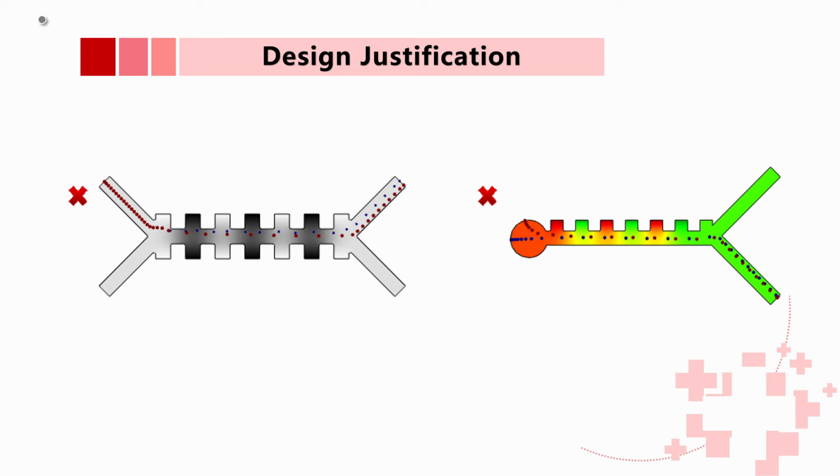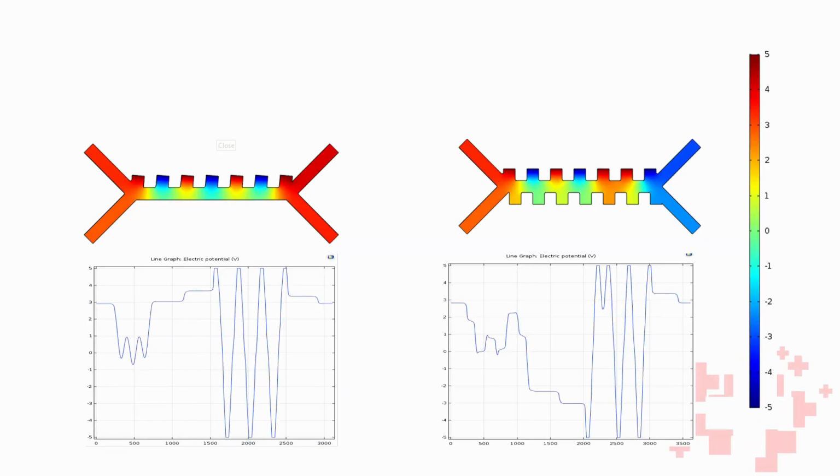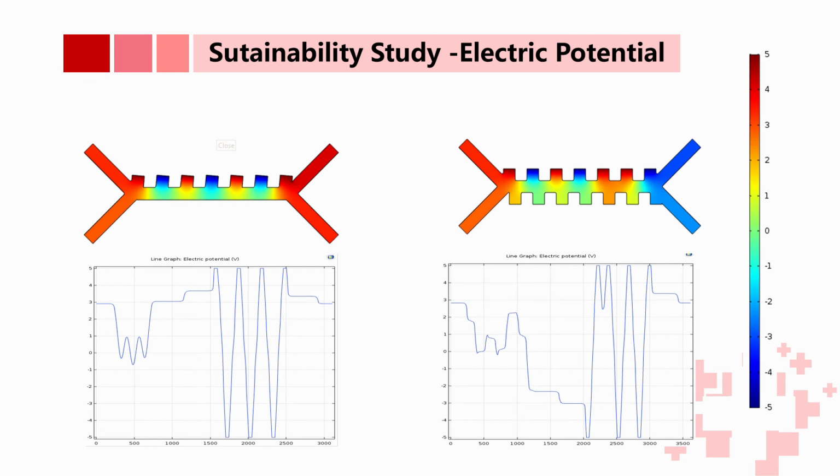And for the second one, we tried to use one inlet, and we could see that since there is no second inlet where the hydrodynamic force is exerted to make the cancerous cell float upwards, this one also shows that both the particles end up in the same outlet, due to the cancerous cell sinking down.